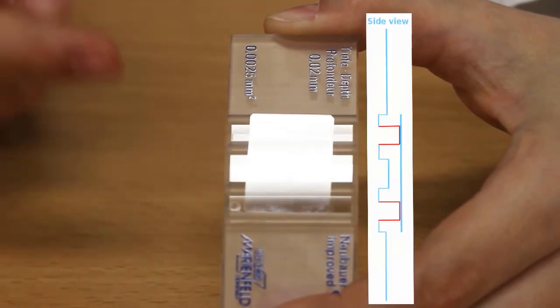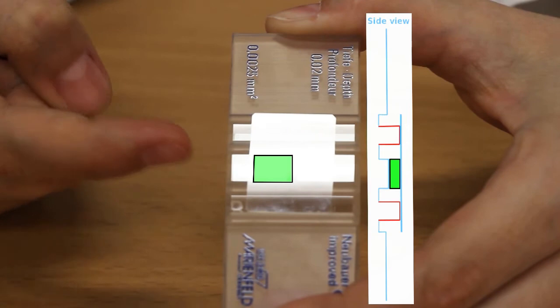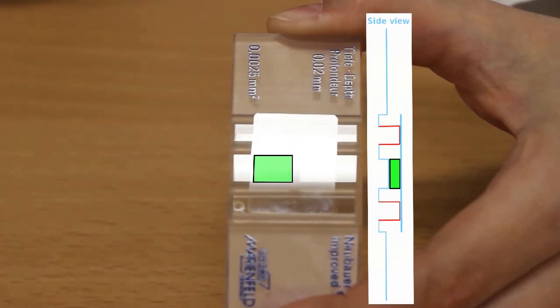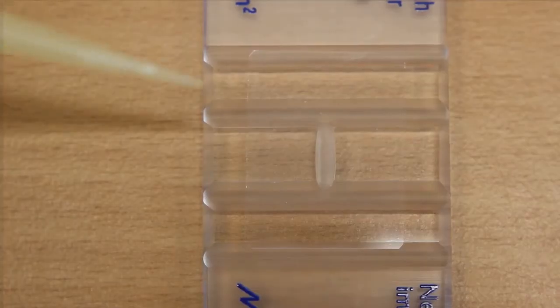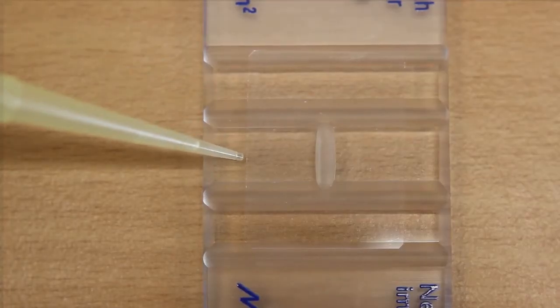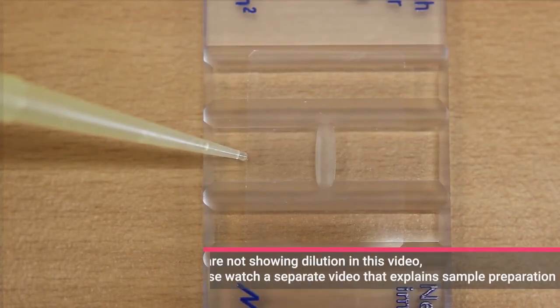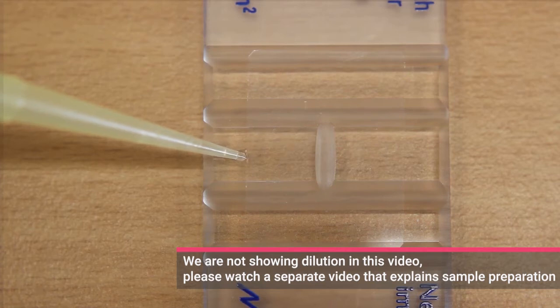A chamber of defined height is created between the coverslip resting on the support structure and the sample below. Load the chamber by pipetting your sample next to the coverslip. Capillary forces will suck the fluid into the chamber. Make sure not to overload it.